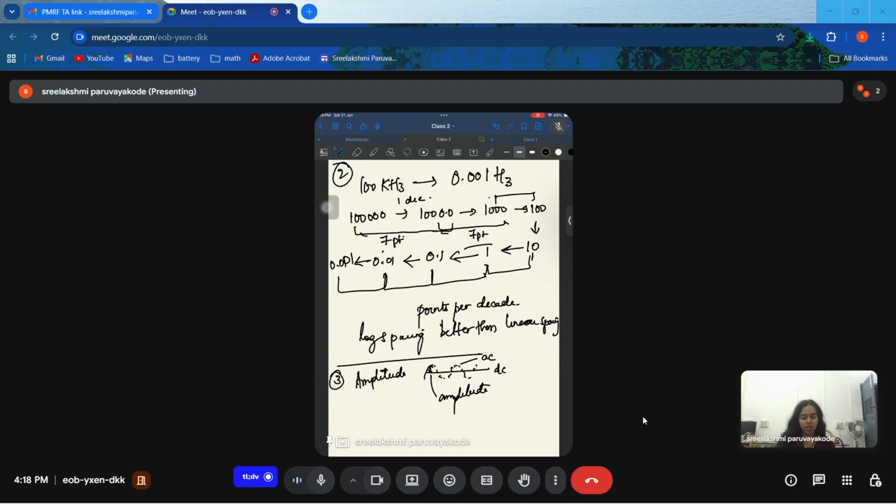It is oscillating. It can be this big, it can be this range, can be this part also. Which is better? Now, when I'm applying 5 millivolt, it doesn't mean it's going to be exactly 5 millivolt. This itself will have some noise, and there's noise from the system too. If it is this big, non-linearity is introduced in the system. We'll be seeing it later.